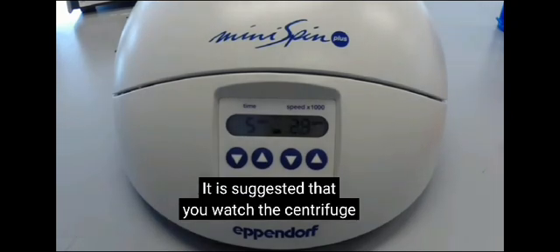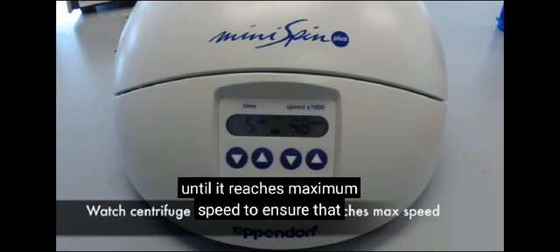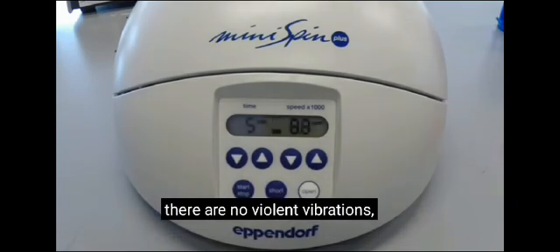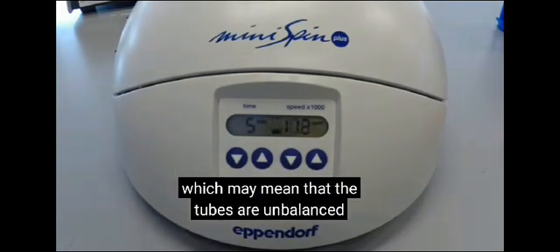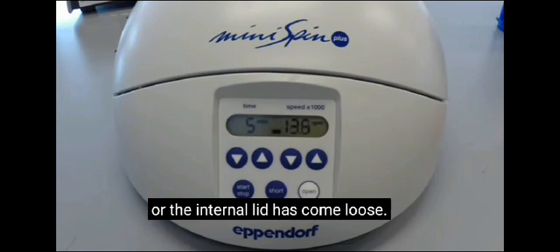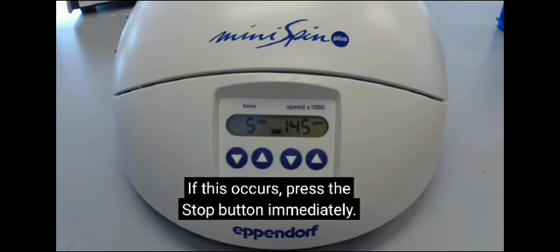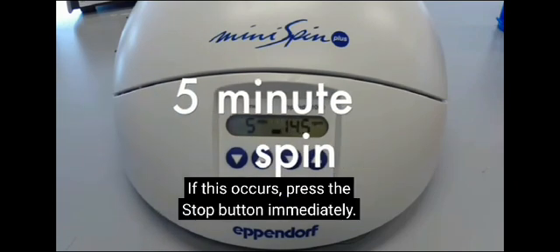It is suggested that you watch the centrifuge until it reaches maximum speed to ensure that there are no violent vibrations, which may mean that the tubes are unbalanced or the internal lid has come loose. If this occurs, press the stop button immediately.